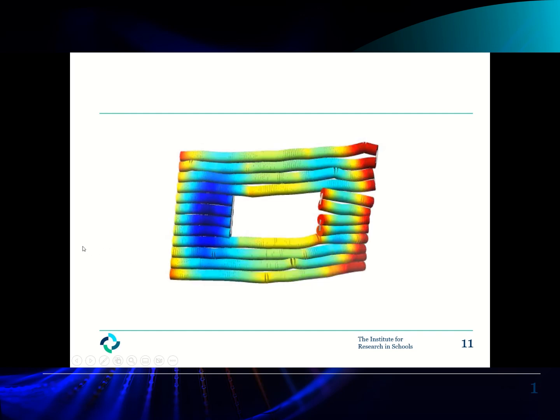So there's lots and lots of things you can do to improve and hone your design, and this is what the designers and researchers are aiming for, is to use the computers and software to take a lot of the error out of the designs before a costly mistake is made.